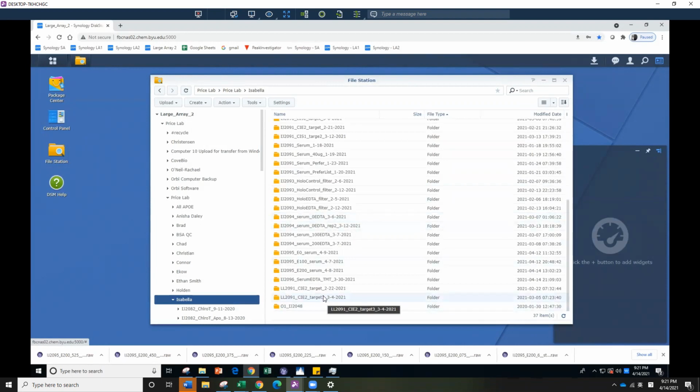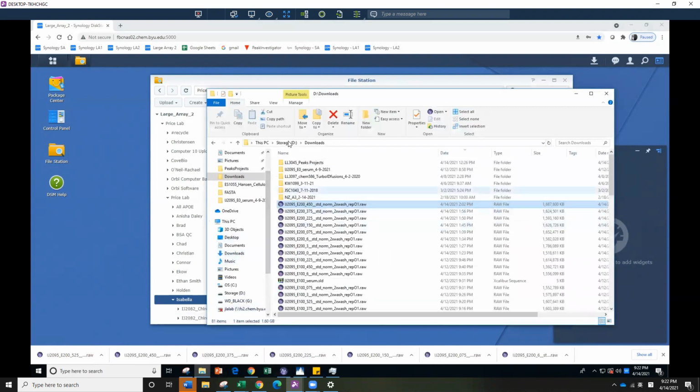So just make sure you are being active as the TA that is on the instrument, like when your samples are going to complete and if they have uploaded files for you. So after the upload, your files should be here. Okay, so today I already downloaded the files I need, and in regular circumstances, it should go directly to the download. So these are the files I'm going to start analysis today.